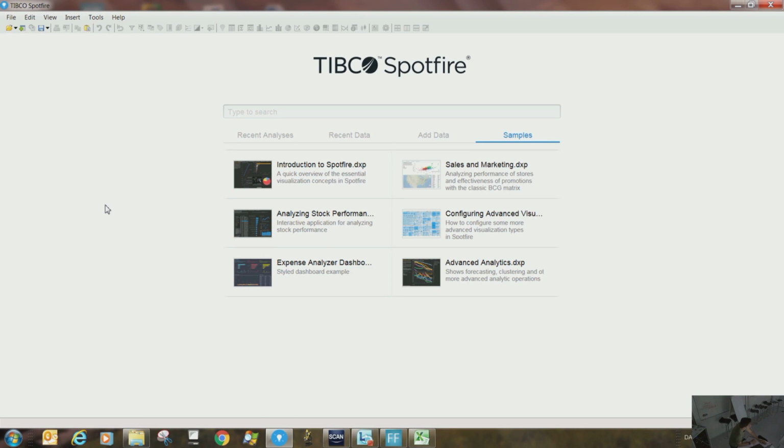There are 2 CPR workstations where it is installed, and one is on my laptop. So just in case you come and want to process, you can. We also have some free licenses available, so we would still have to purchase the workstation and then install it, right? Okay, so this is how the Spotfire frontend looks.